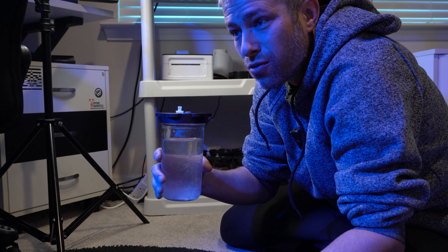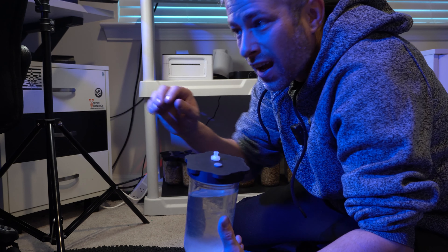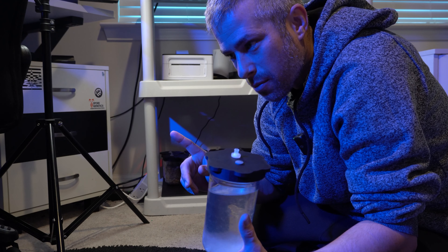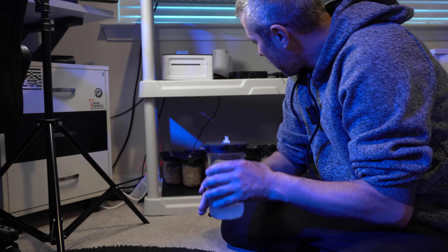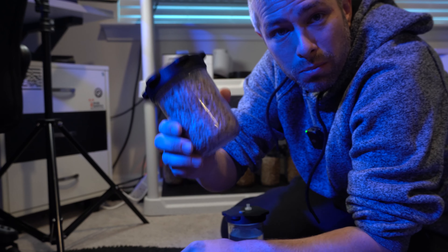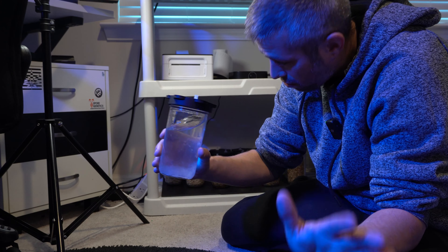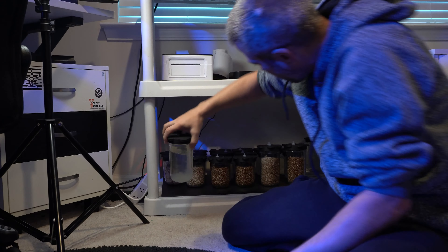Making master liquid cultures is really easy — it's basically two little tiny scoops of food in there, then you pressure cook it, and you've got yourself a master liquid culture brewing up. What's actually getting me excited is realizing it was just the Amazon strain that took so long. That particular syringe, for whatever reason, was just super slow growing. I've noticed that across different strains of mushrooms — it's not necessarily the species itself, but the specific strain or source.